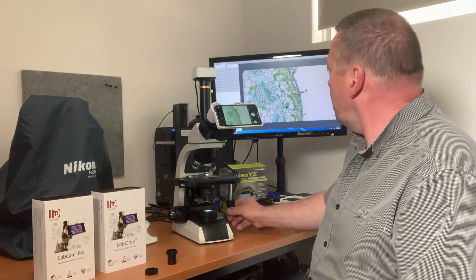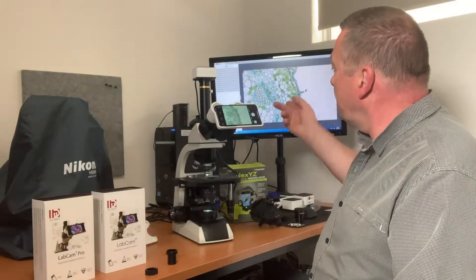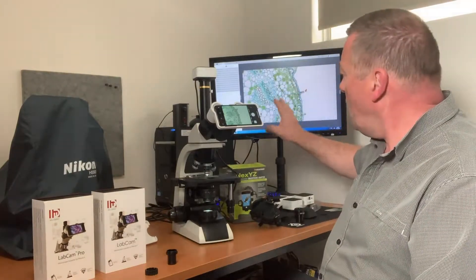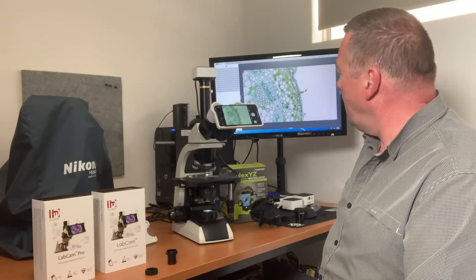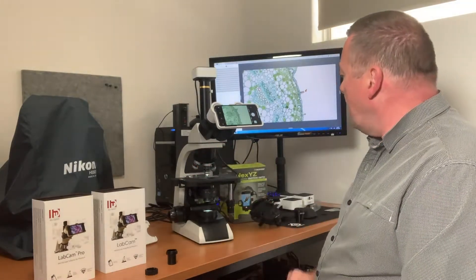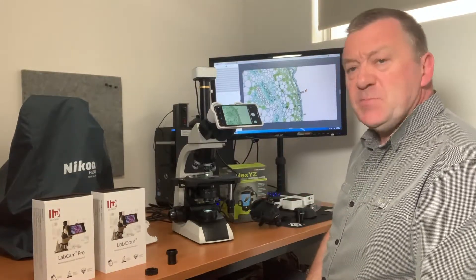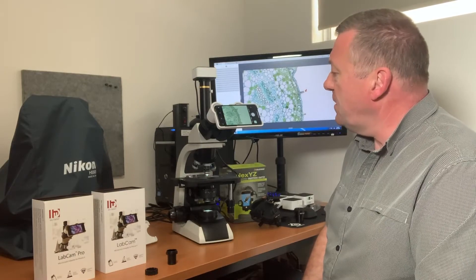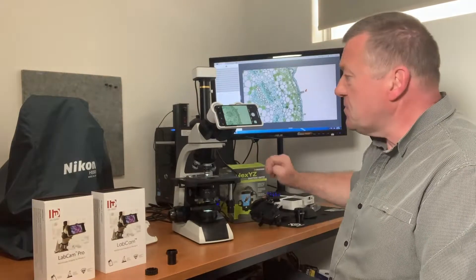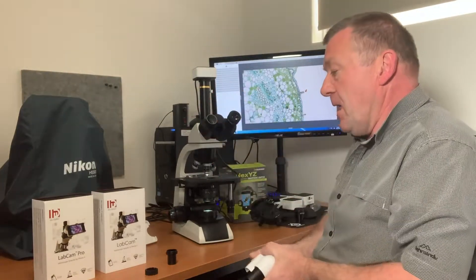I want to highlight the difference between focusing with the camera versus focusing with the phone. With the dedicated camera monitor, having a bigger screen allows you to see your specimen in a lot more detail and makes it much easier to focus your microscope. I did find it very difficult to focus the specimen using the phone, and that applies to all the iPhone adapters including the Celestron. Now I'm going to put on the LabCam Pro.